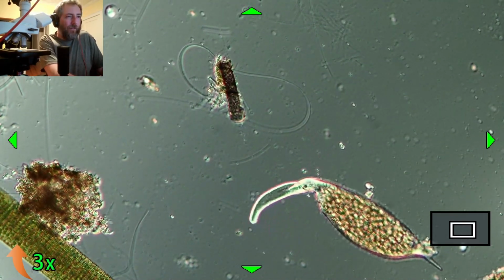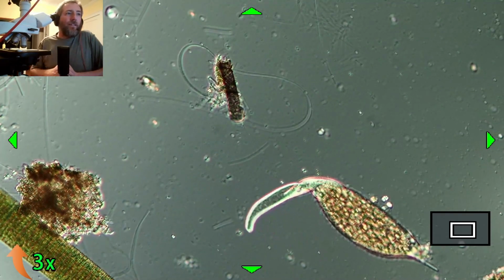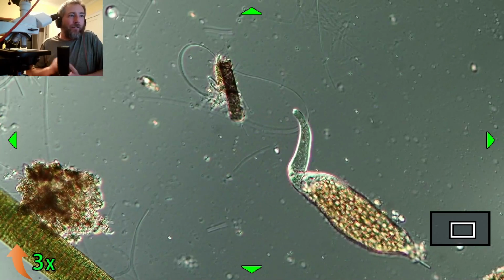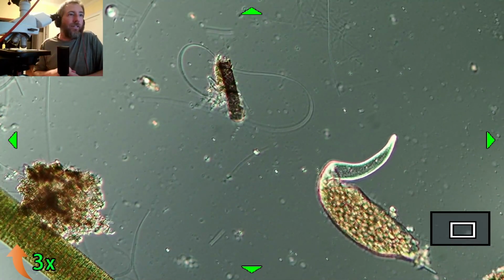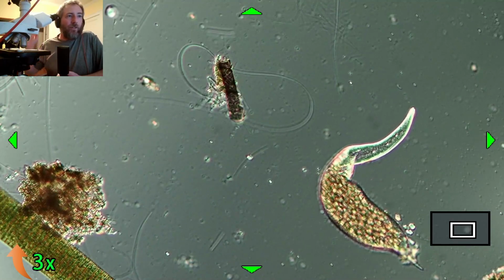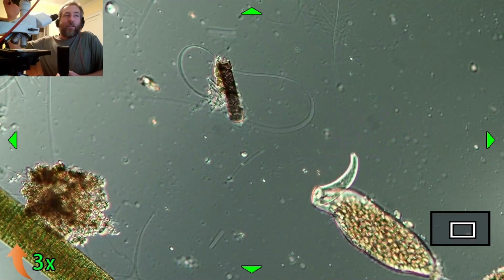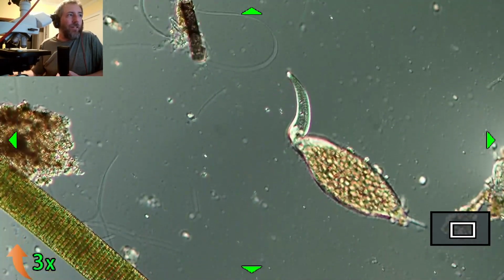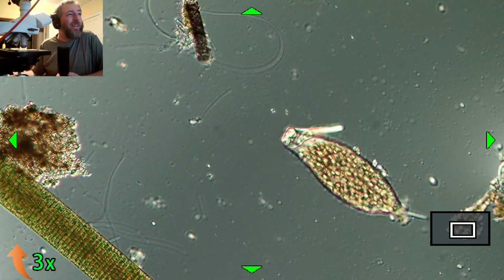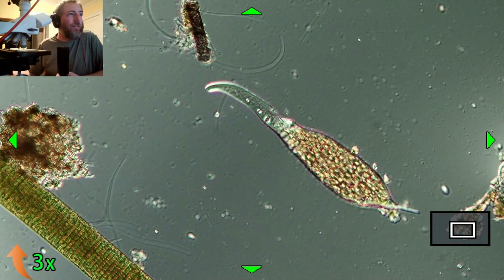Microscope that we're using is this one. It's a Leica DM2500, and it has 5, 10, 20, 40, and 100x objectives, and we're actually looking at it at the 10x objective with a 10 times magnification for the eyepiece, and then my camera is multiplying that by 3, so we're not quite 300 times, but we're kind of close to 210 times magnification, something like that, 230? I don't know the exact number.